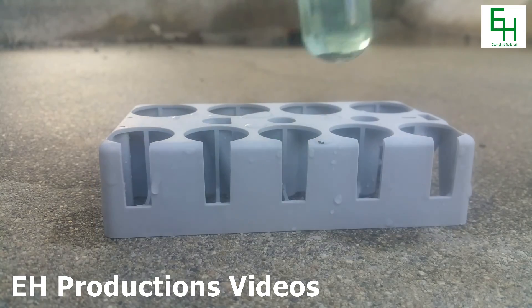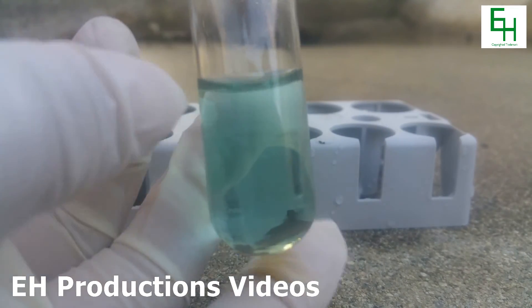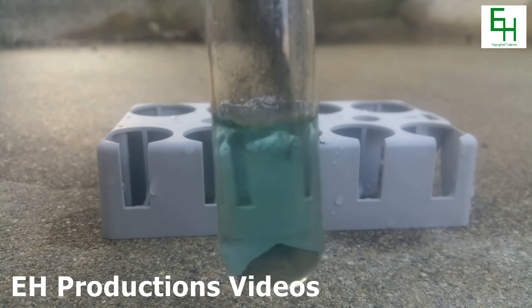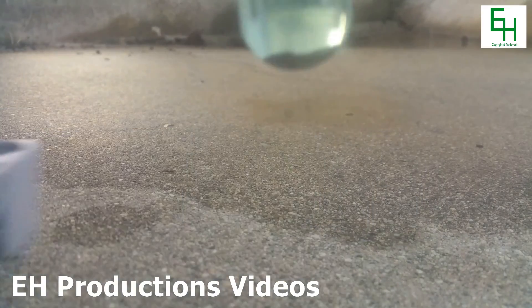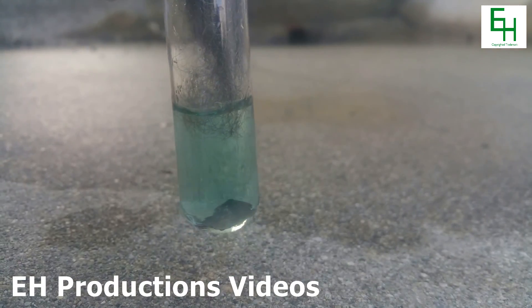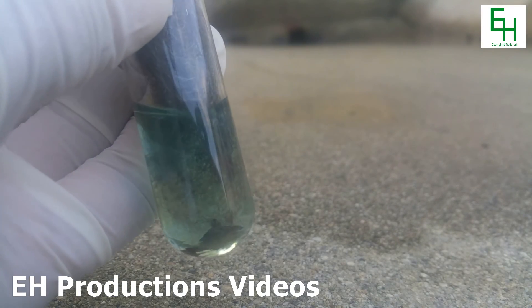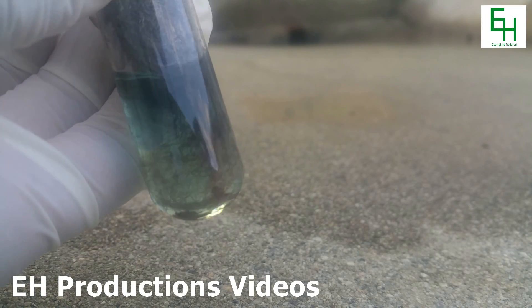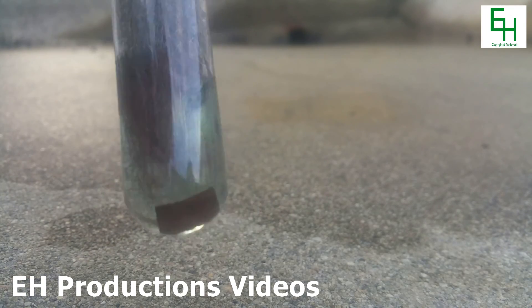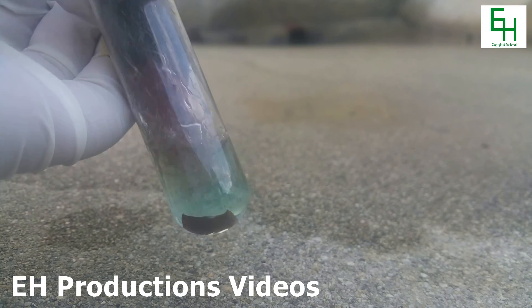This is copper plating with copper sulfate. Let me take this back on because this is really cool. Let me stick this in — if we let that sit in the solution for just a little bit and look what happens when we take it out.